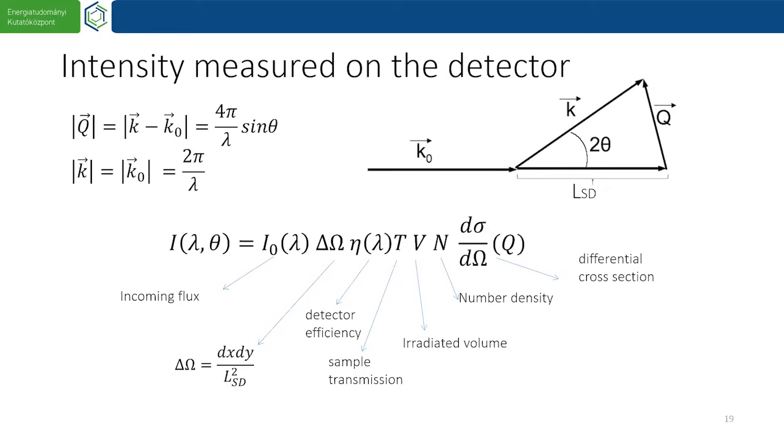Yes, right. It's only that this equation is written in this way to be in one row. Otherwise, we must determine this and divide the measured intensity by all these factors here. But this is done by the software, so we will not do that part of the analysis.